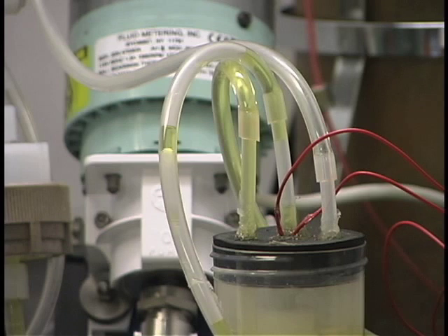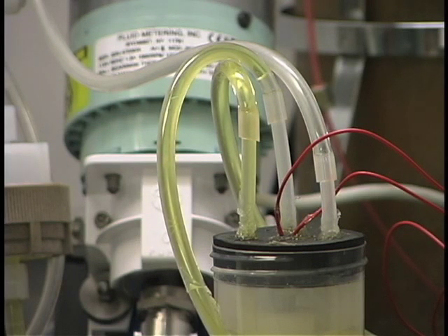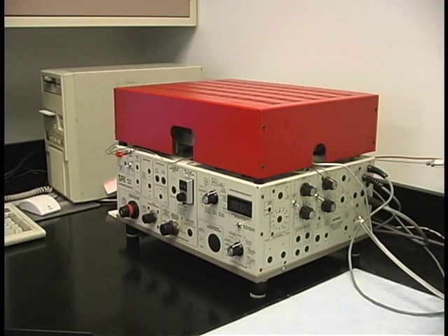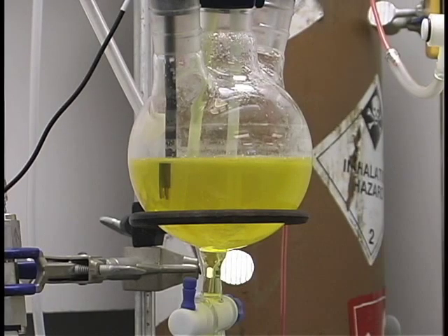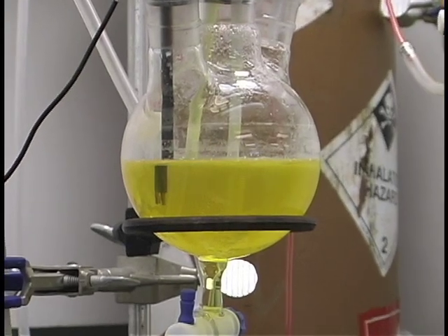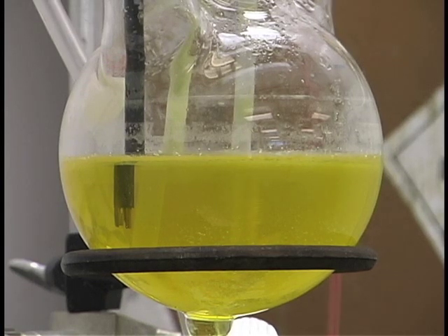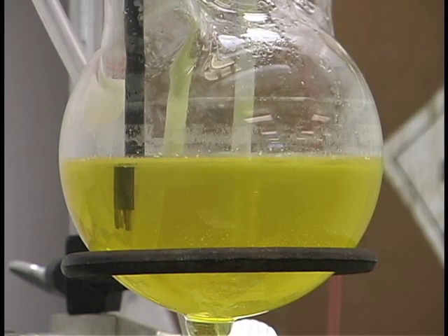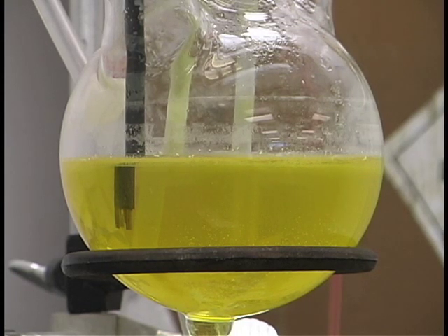Segregated pockets of gas and sulfide solution can be seen pushing through the 1/4-inch connection tubing into the separator. The gas exiting from the separator passes through a sampling loop on the chromatograph and then on to an inverted graduated cylinder, whose liquid volume is displaced by the hydrogen gas. Once the hydrogen gas has been separated out, the complexed sulfur solution is returned to the scrubber. The scrubber vessel immediately becomes turbid from the release of elemental sulfur, as it is being held at a pH where the disulfide complex is unstable.